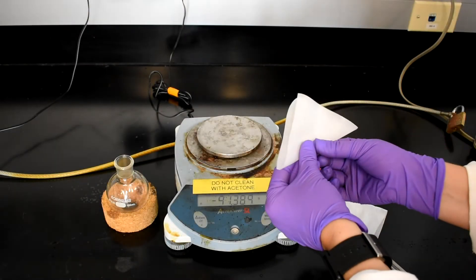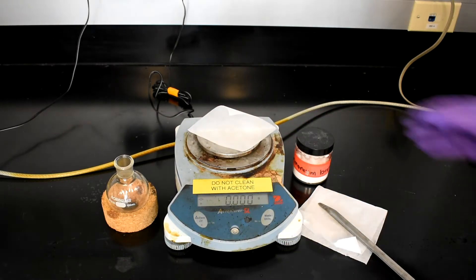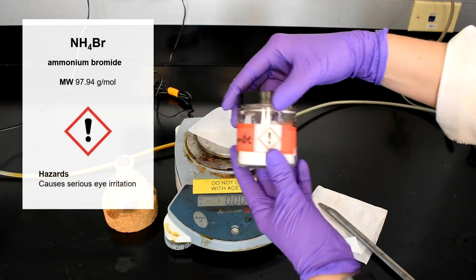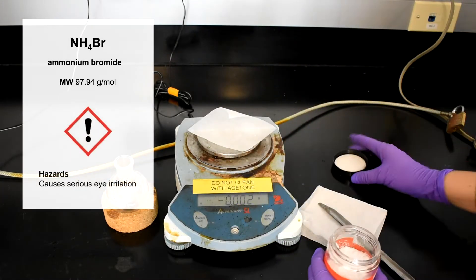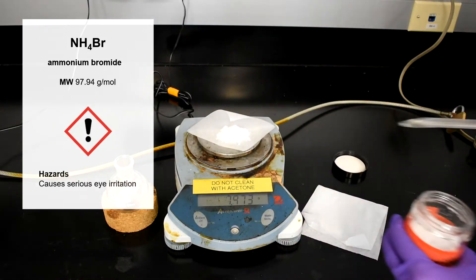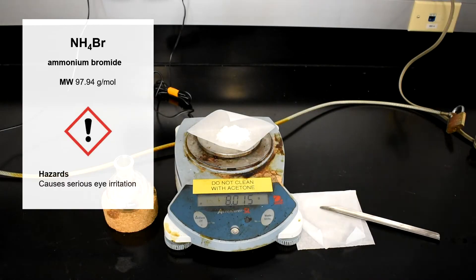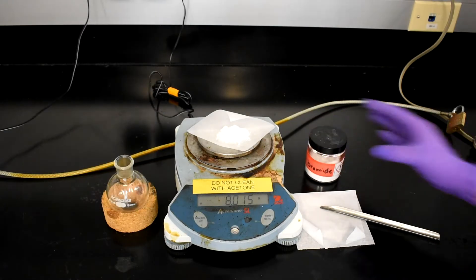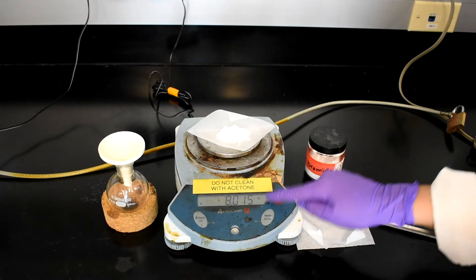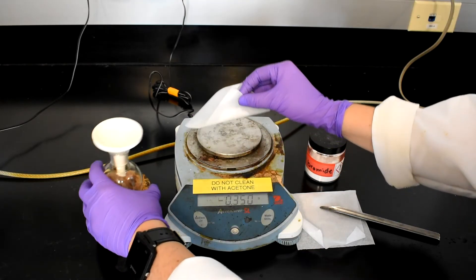Fold the weigh paper in half to make two triangles and zero out the scale. Weigh 8 grams of ammonium bromide. Use a spatula to carefully weigh out 8 grams. Be sure to write down the amount weighed. Use the bottom of the funnel to add the ammonium bromide to the round bottom flask.